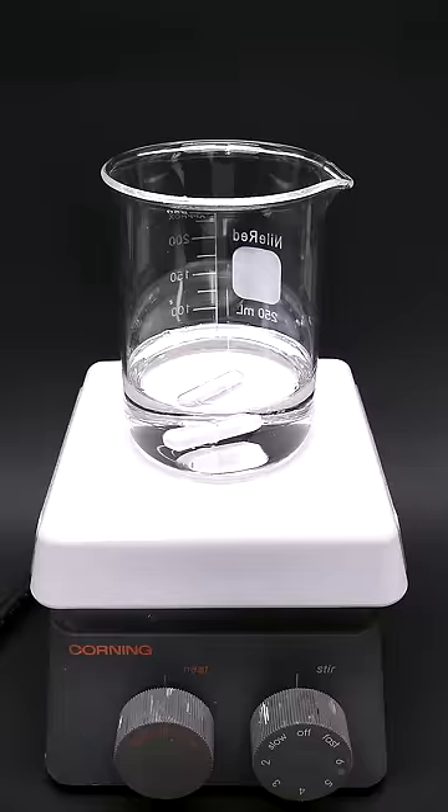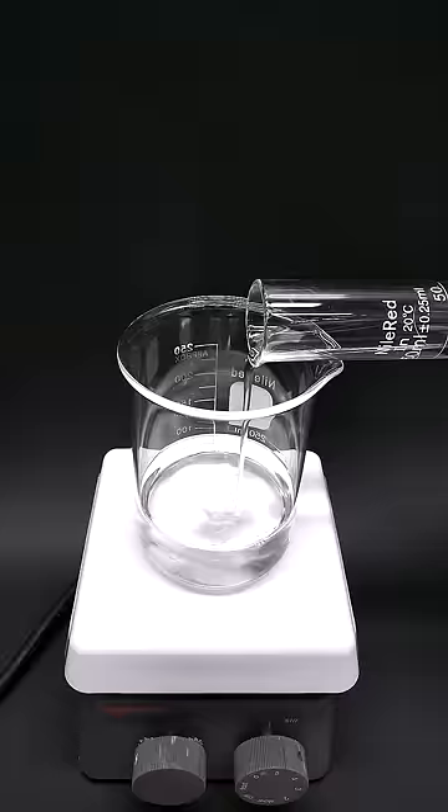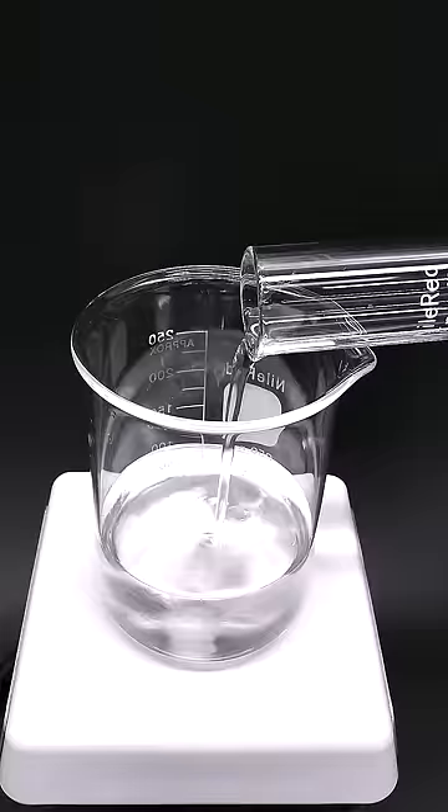To do this, I just have to start with some concentrated sulfuric acid, and then carefully add 30% hydrogen peroxide. It's important that I do this very carefully and to never add too much peroxide, because it can actually become explosive.